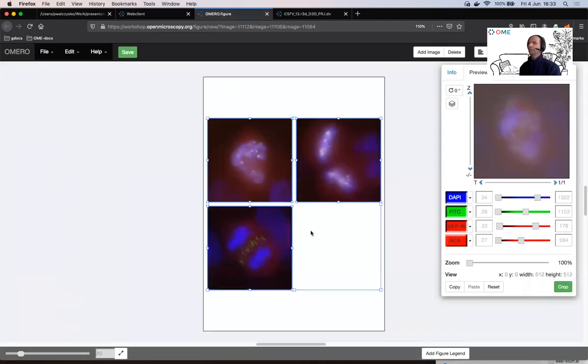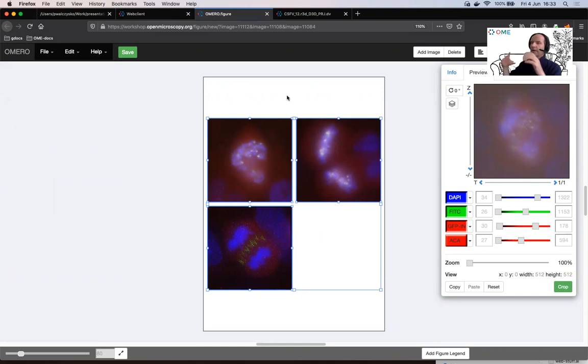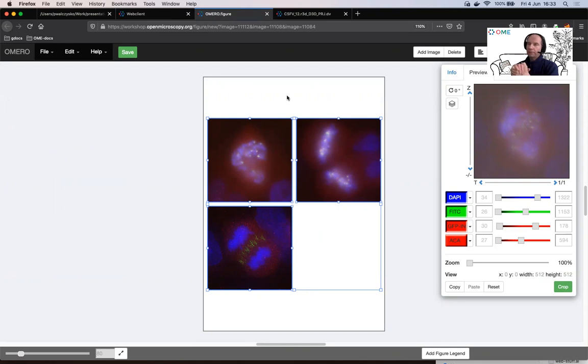As I said, OMERO figure will be highlighted in detail on day two, but like this from this short demo you will understand how all the pieces are cooperating with each other in this OME ecosystem.